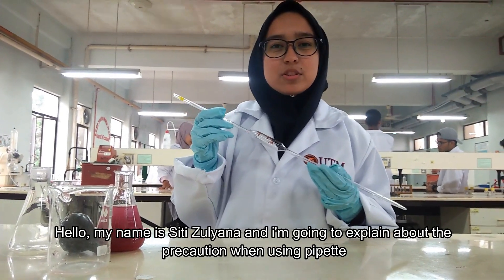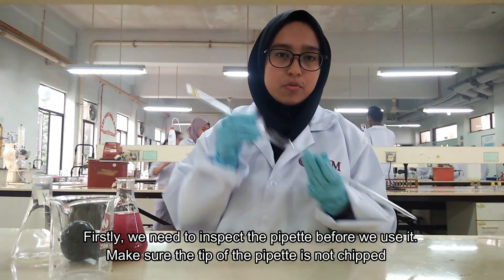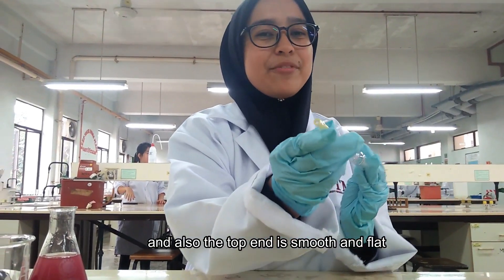My name is Siti Tiana and I'm going to explain about pre-washing when using pipettes. We need to inspect the pipette before we use it. Make sure the tip of the pipette is not chipped, and also that the top end of the pipette is smooth and flat.